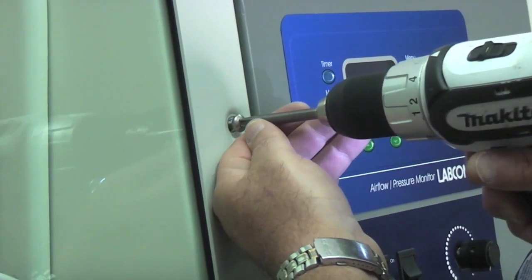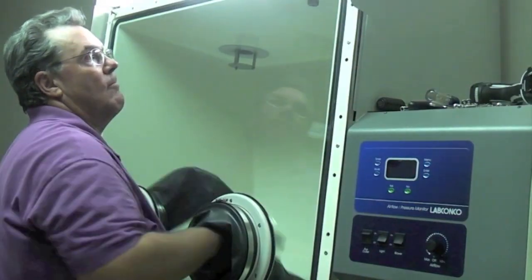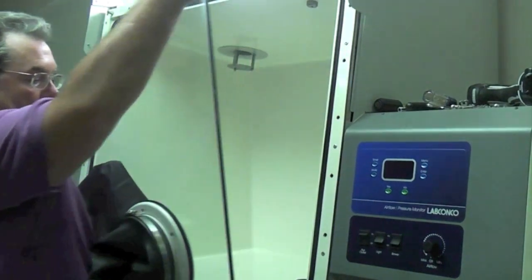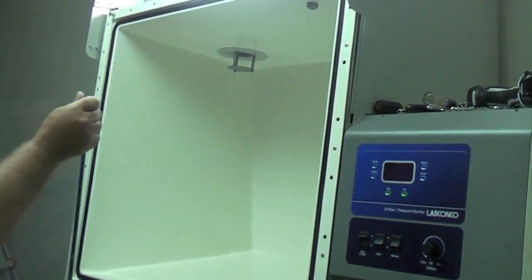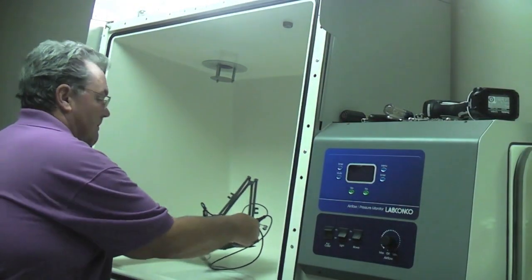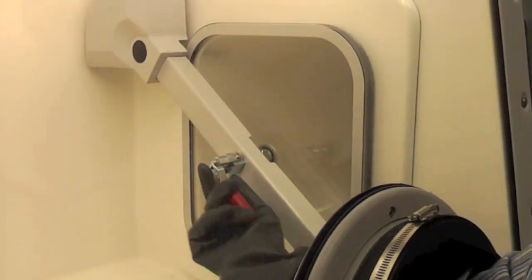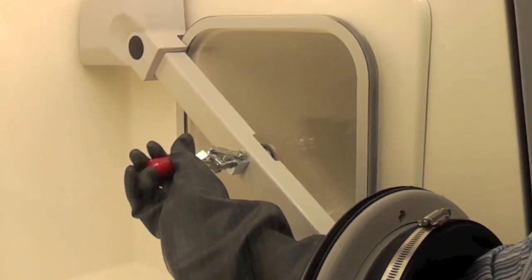The large 36-inch wide by 27.6-inch high safety glass window is removable for loading oversized materials. The inner and outer transfer chamber doors pivot upward to save space.